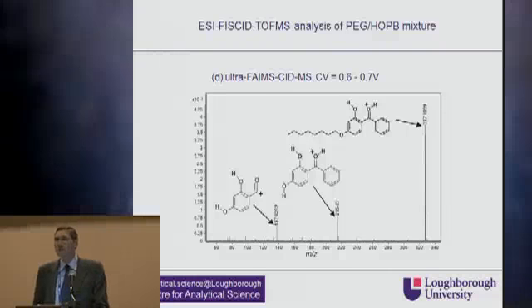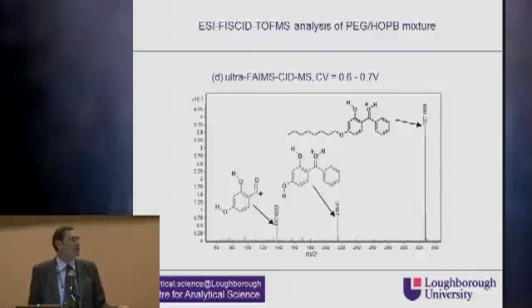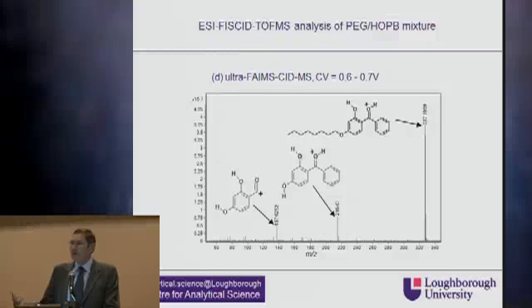So we have the potential for enhancing the spectral quality so that we can confirm the presence of HOPB on the basis of the precursor ion and the characteristic fragments of HOPB. And not only can we use this for identification purposes, we can enhance the quantitative analysis of these compounds because we added another selection criterion.